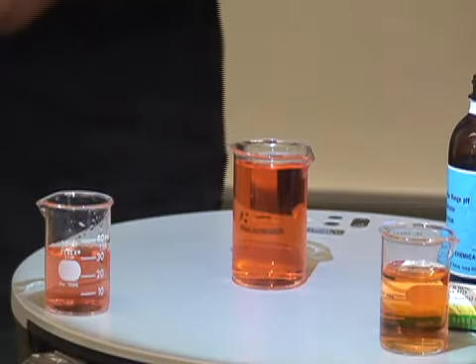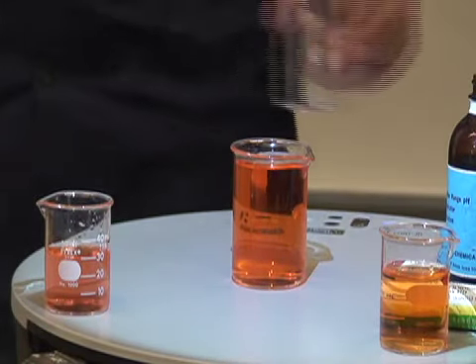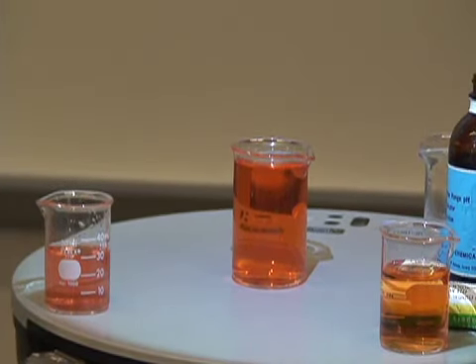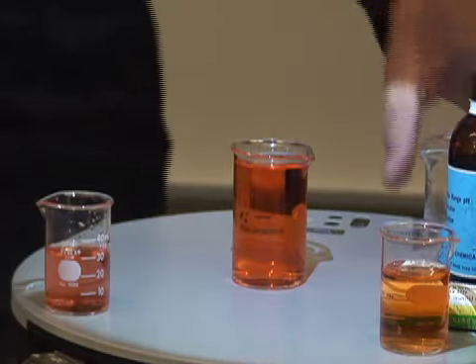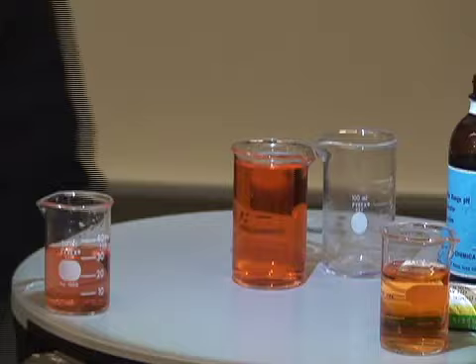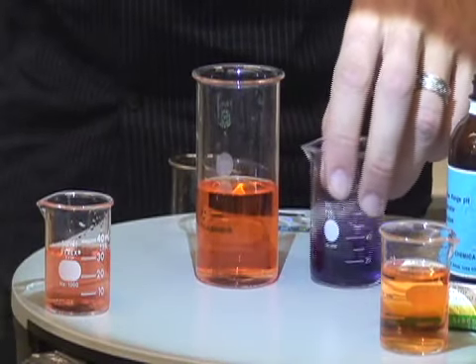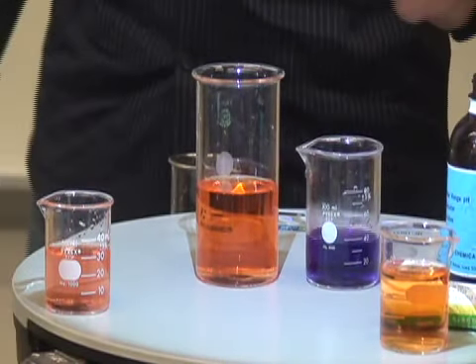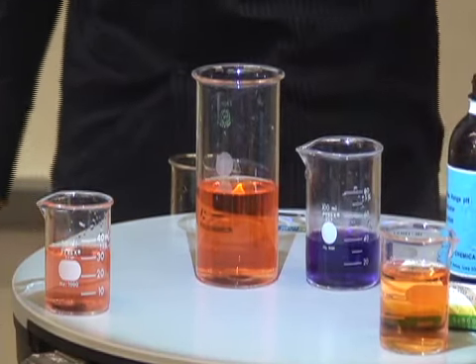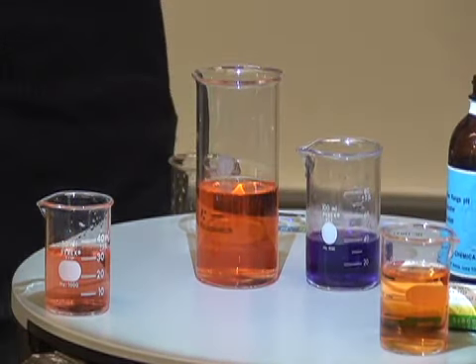What's the deal? Hydrochloric acid stronger. Ha! That's a weak base. Josh, good man. Did you notice what happened? We had that thing, it was at a pH of 11. I'm going to do that again. It's obviously quite basic, isn't it? It's on the 11 end of the base scale. Now, in there was hydrochloric acid.